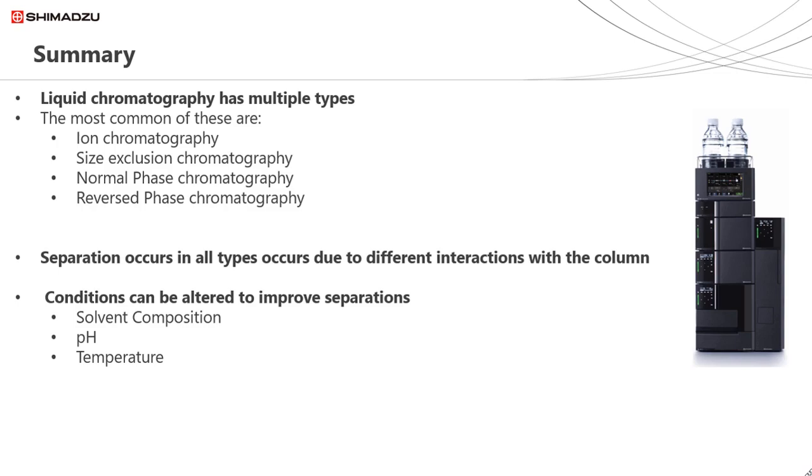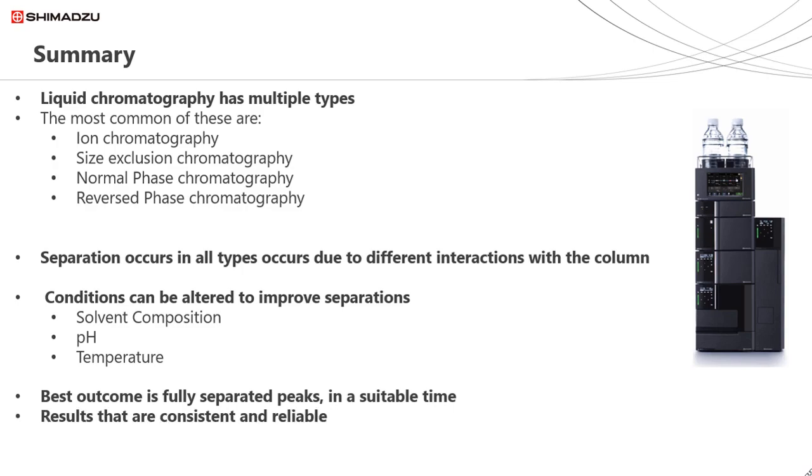What we are trying to achieve is a method that produces fully separated compound peaks in a suitable time. This method would be consistent and reliable to achieve the best data.